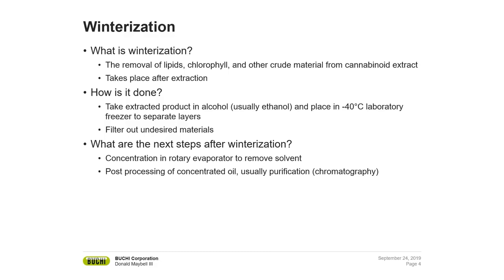Rotary evaporation comes into play by concentrating and pulling off the solvent so you are just left with your concentrated oil. After you've concentrated your oil, then the next thing is your post-processing, whatever that may be. You might need to further purify it, and that's where chromatography will come into play. You can get more information on that later this week.